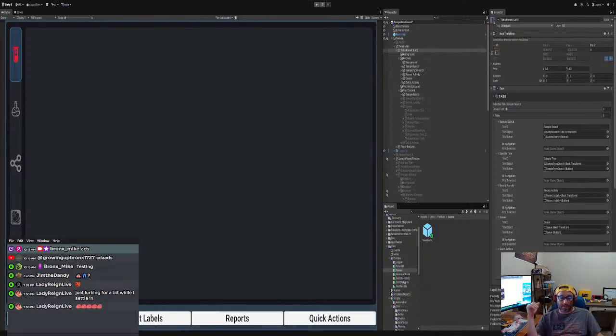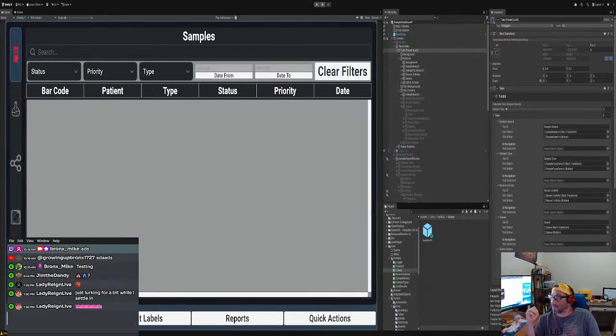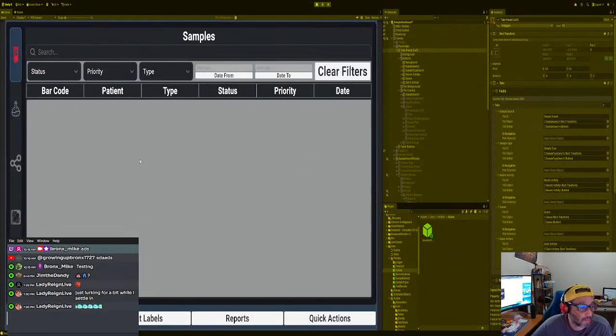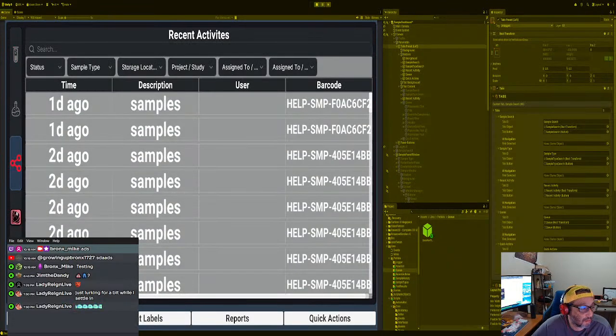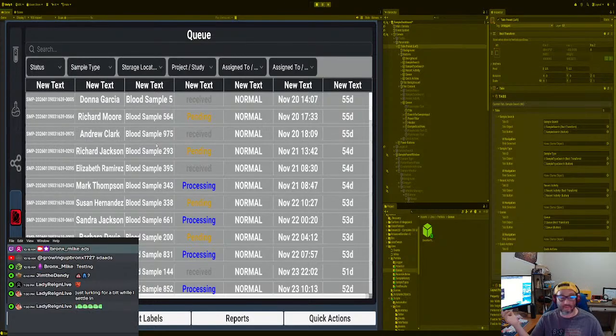It's still loading. Yeah, you can't see it. Yeah, it's hard. The screen doesn't show it. There we go. Okay, so oh, it's loading again. There we go. Okay, we got that's working. That works. There we go. Beautiful, right, folks? Beautiful. So it's a queue.